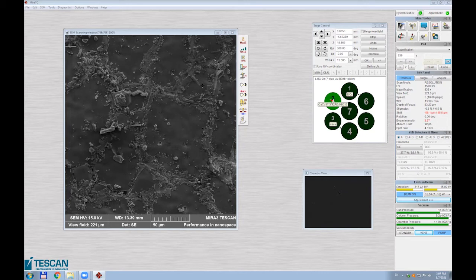We don't need a really great one. And we put on the quantify and auto quantification. By auto quantification, you really get an idea of what you have in there. So it's copper, titanium, calcium, and aluminum for sure, and oxygen and carbon there. So this is the first insight into what is in your sample. Then you can even quantify it, so you have an amount of material.